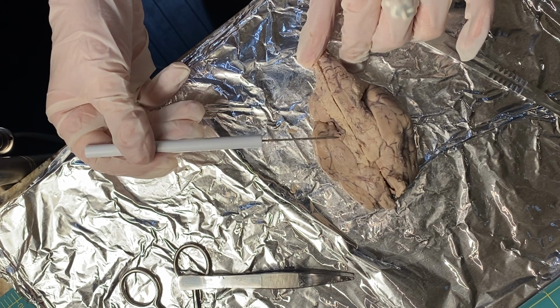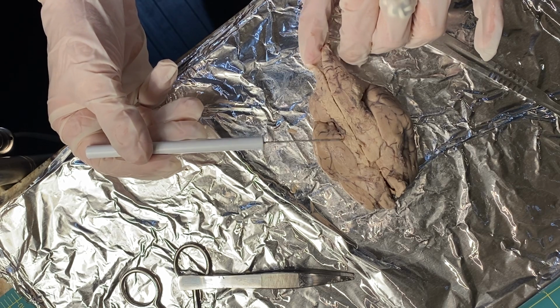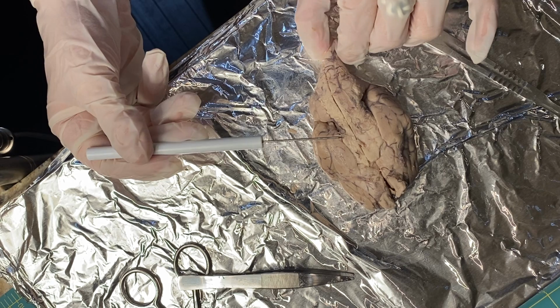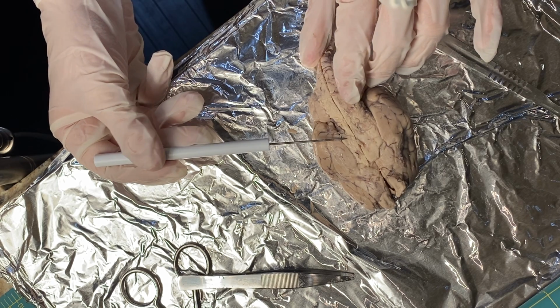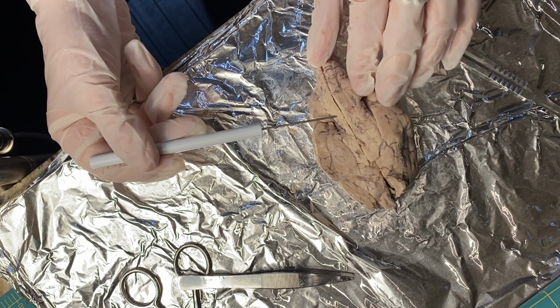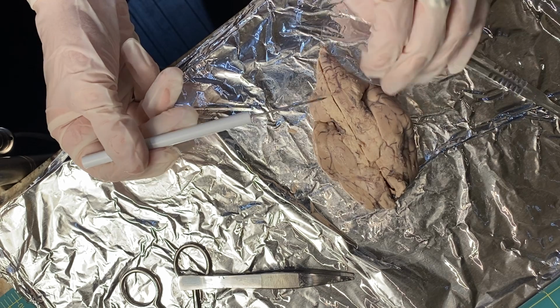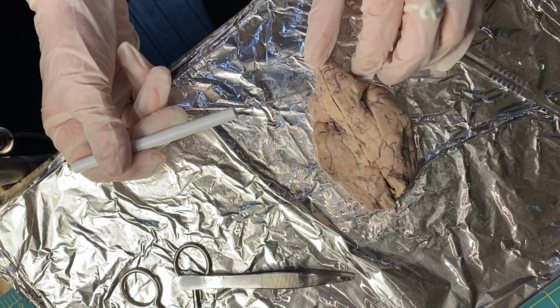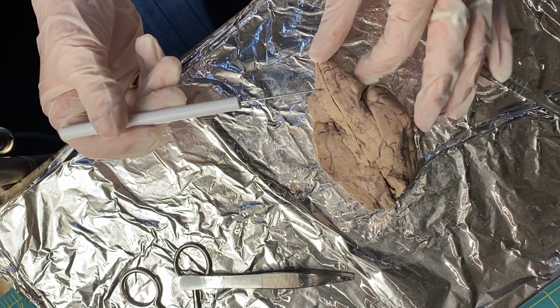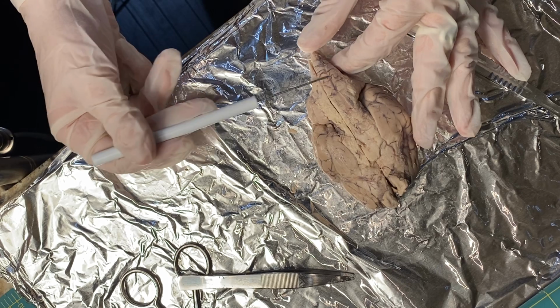So if we go down here a little bit, we have our oculomotor nerve, which is our cranial nerve 3, and then our trigeminal nerve, which is our cranial nerve 5, and then our abducens nerve, which is our cranial nerve 6. So we've got the spinal cord, brainstem.